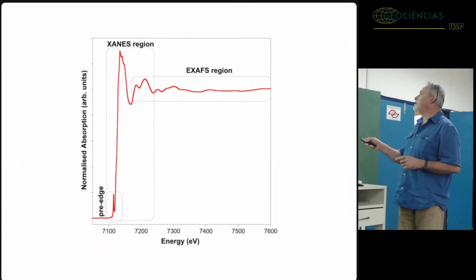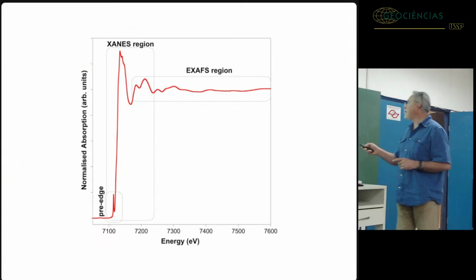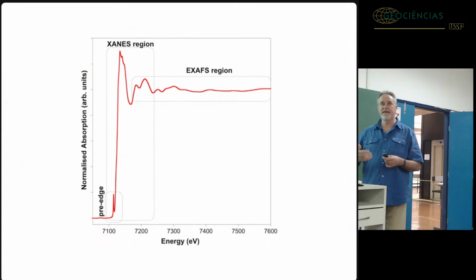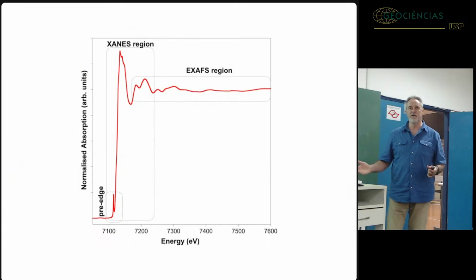And basically, the same principle of this region applies also in this region, but with a difference. Basically, here we have this jump due to the fact that you are expelling inner electrons in a state called continuum, where this electron is delocalized within the whole structure.